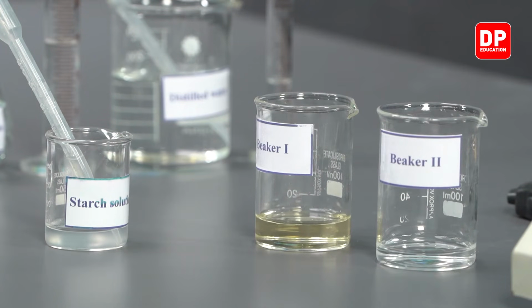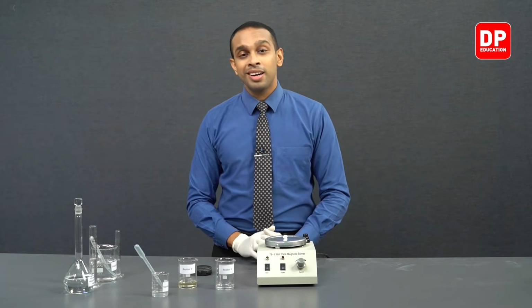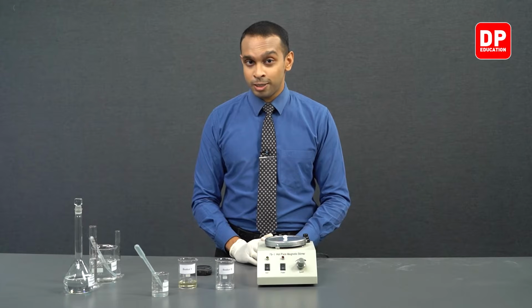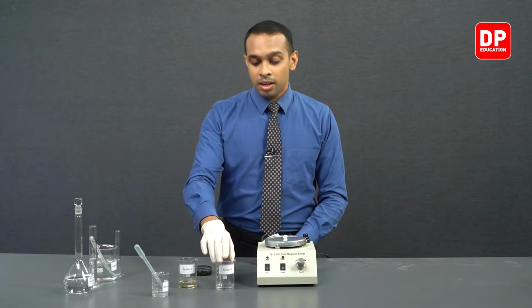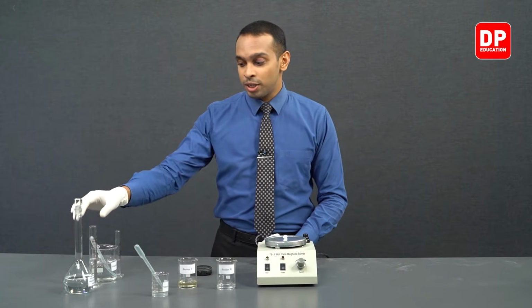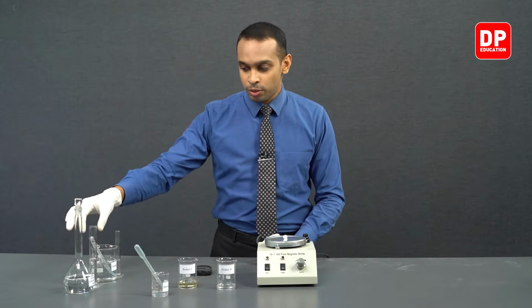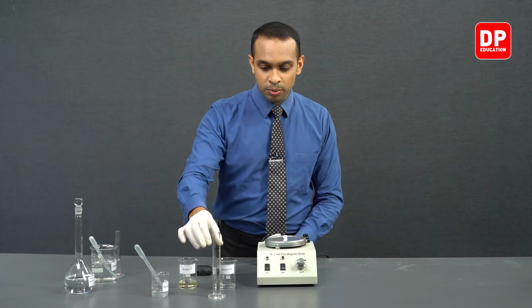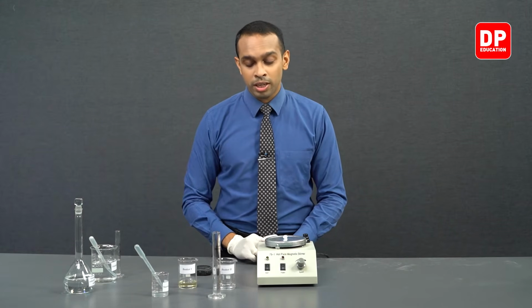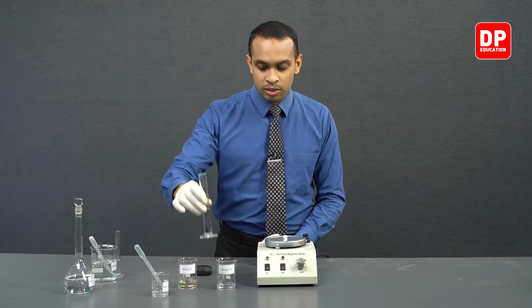So in beaker 2, in this situation, we only have our potassium iodide solution, 10 cubic centimeters of potassium iodide solution. And to this we need to add 15 cubic centimeters of our sodium thiosulfate solution. We have already measured it. We have measured 15 cubic centimeters of sodium thiosulfate solution, and we will be adding this to our beaker 2.